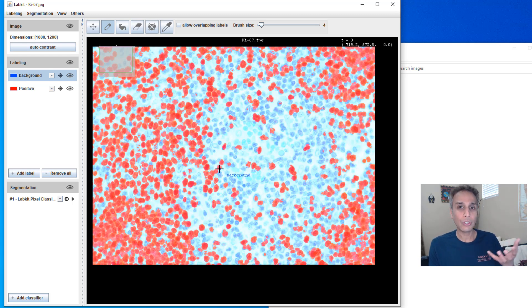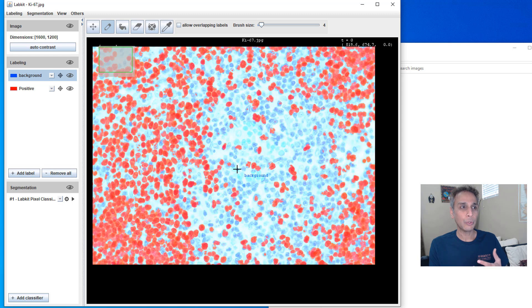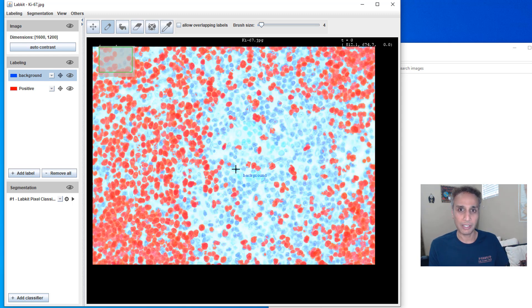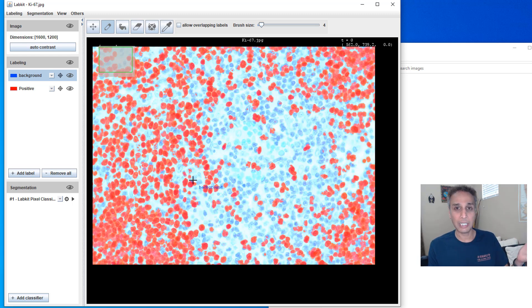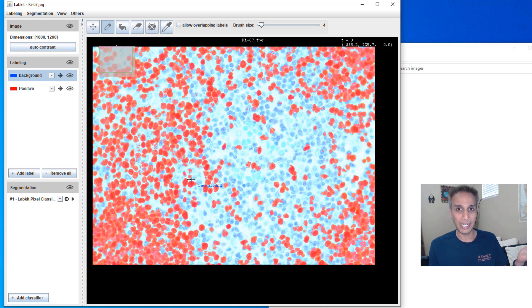Well, I'm trying to use traditional machine learning to speed up my annotation process. That's the key here. But the traditional machine learning is not good at segmenting these type of complex images.